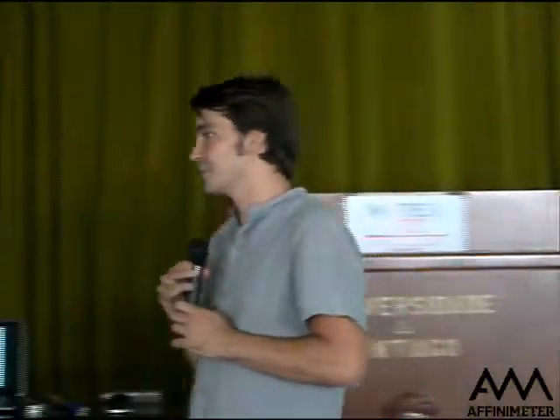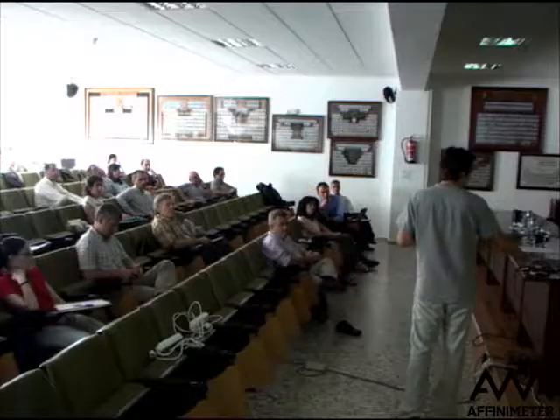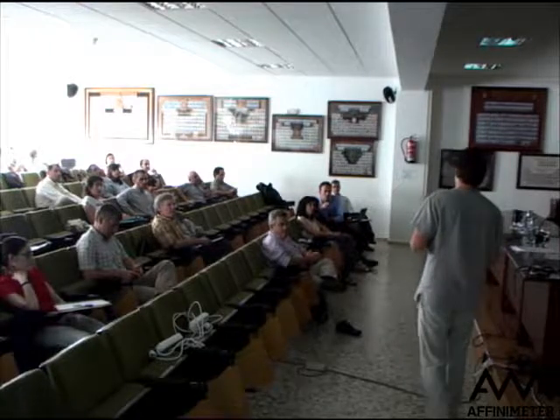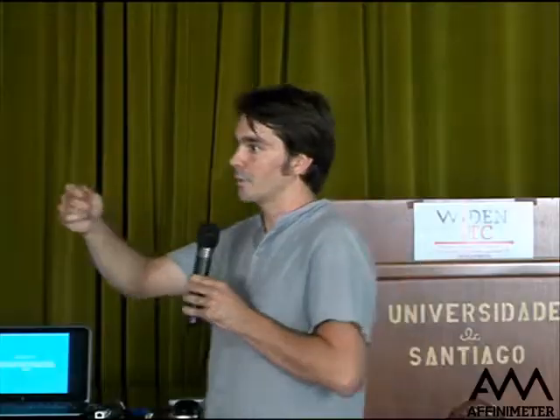Okay, that was basically my question. Is that something that AFFINImeter recognizes itself, or is it something that you have to tell it? It's something that it will recognize, and maybe I will show it in the next talk. It will not allow you to put two reactions with the same result, so it will know that somehow. Okay, thank you.